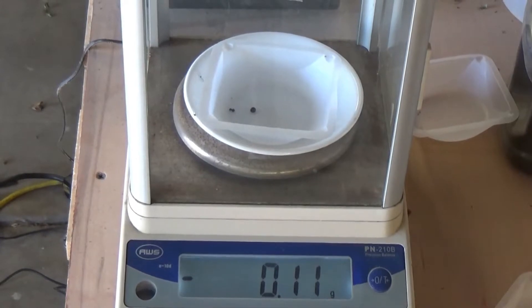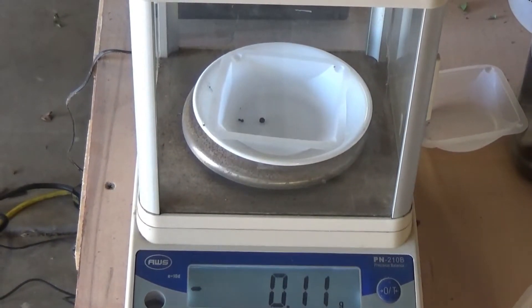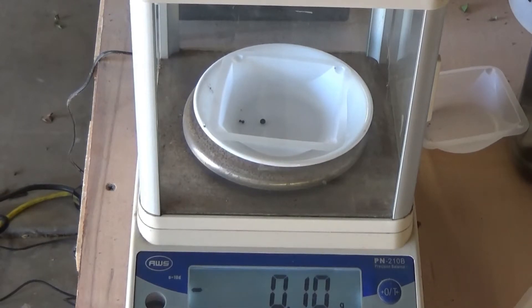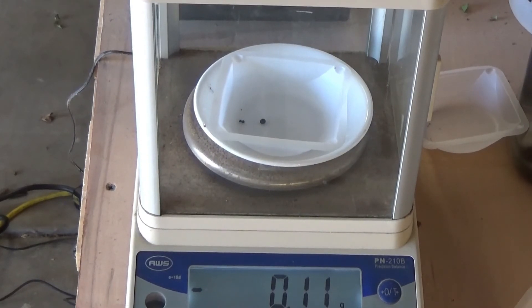These are the BBs that we got out of it, and it is 0.11 grams. That's what came out of this three pounds of Telluride ore.